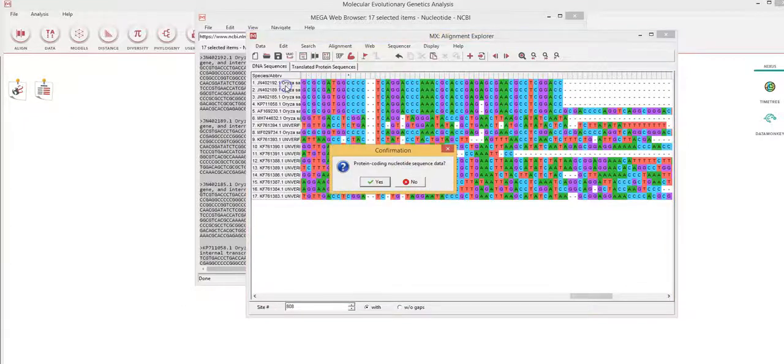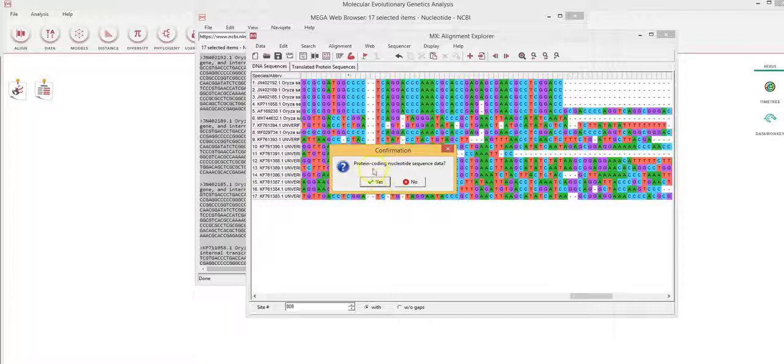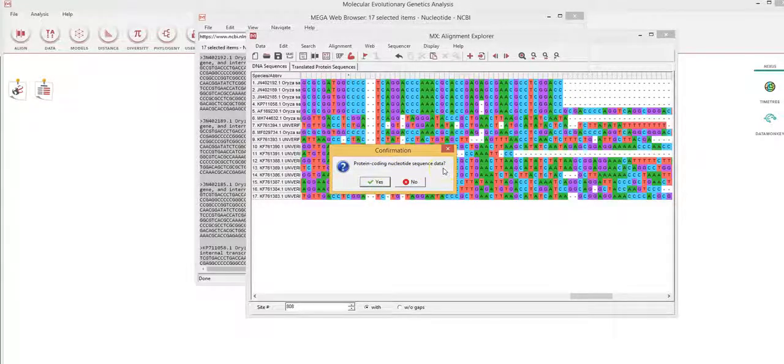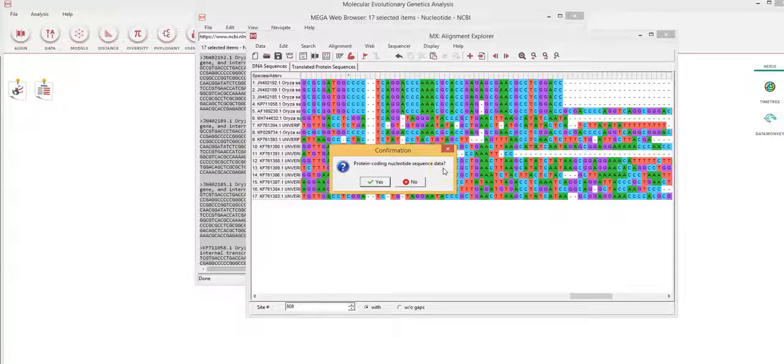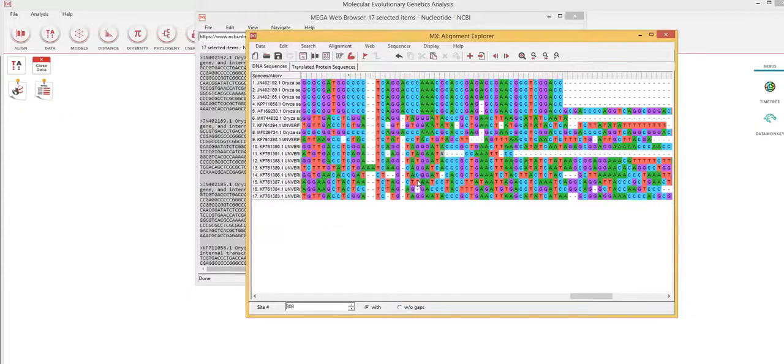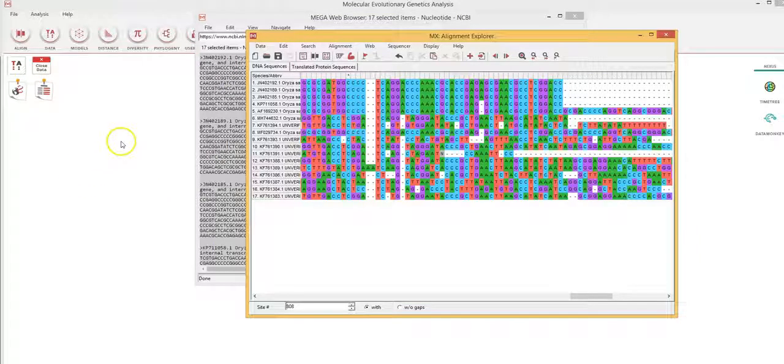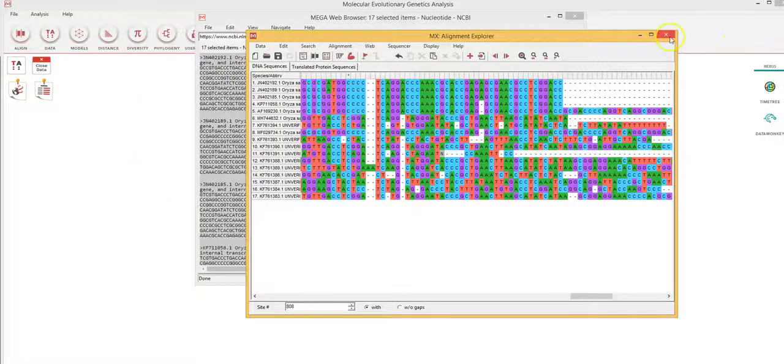And since these are non-protein coding nucleotide sequences, they are purely nucleotides which do not encode for a gene, I click no. They are now imported into the phylogenetic software.